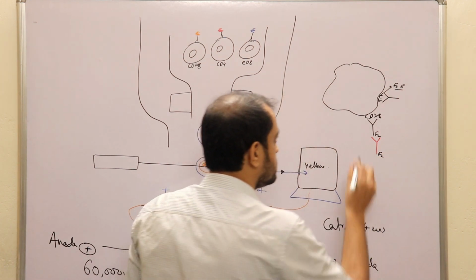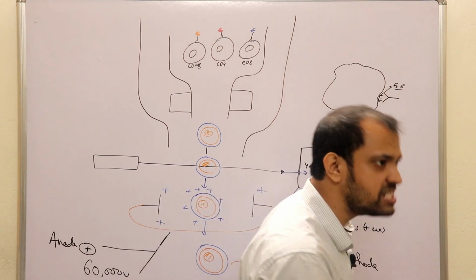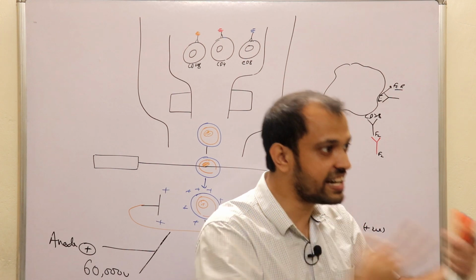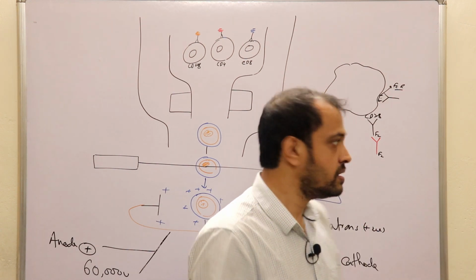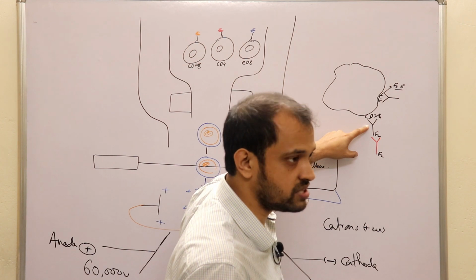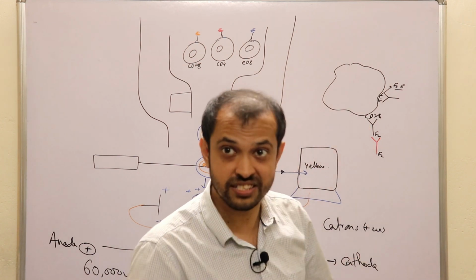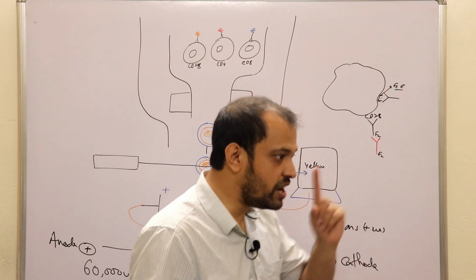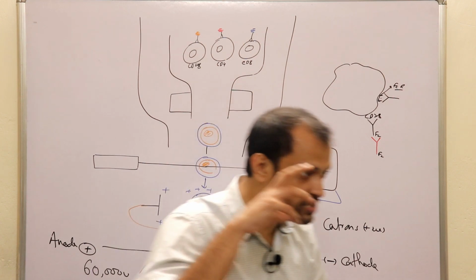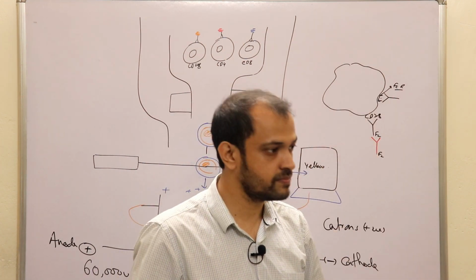This is the cell marker. A marker is a specialized protein to which we generate antibodies, which means these antibodies are monoclonal. Secondary antibodies can be polyclonal, because the FC portion in most cases is the same. But a primary antibody which associates particularly with CD28 is a monoclonal antibody. That's the very basic difference.